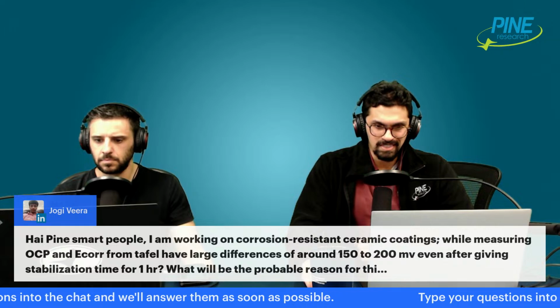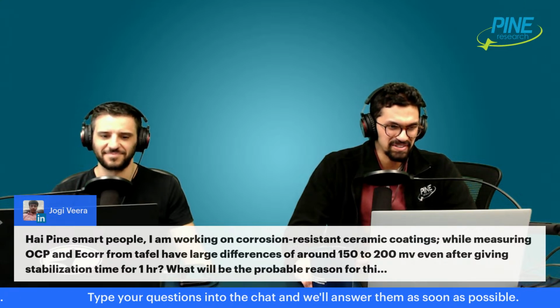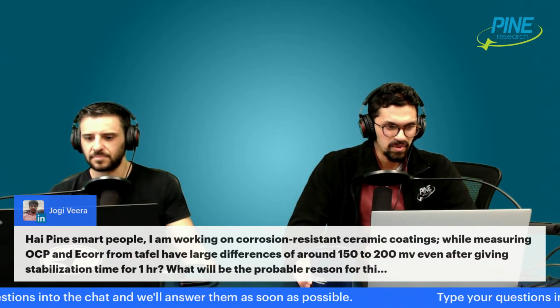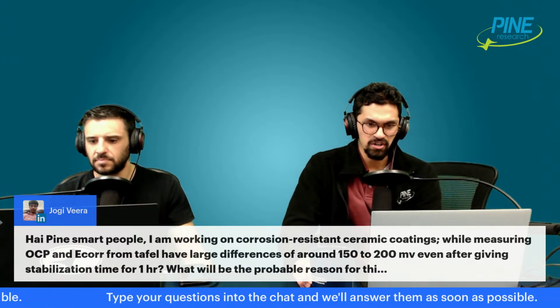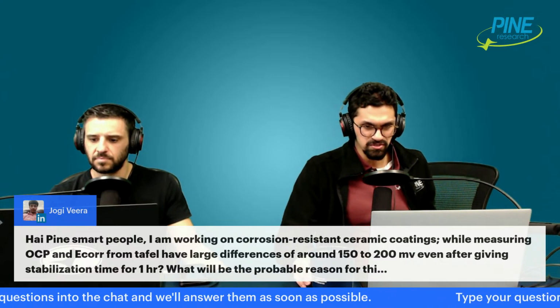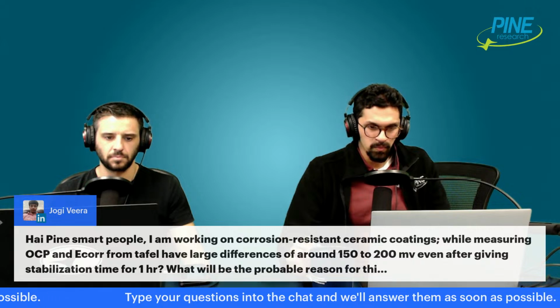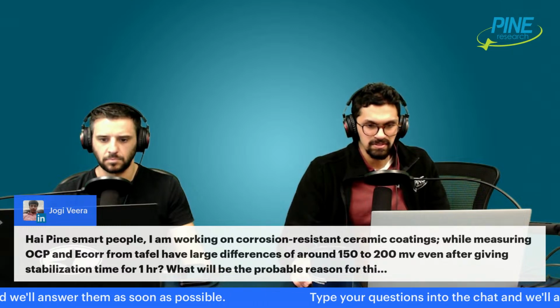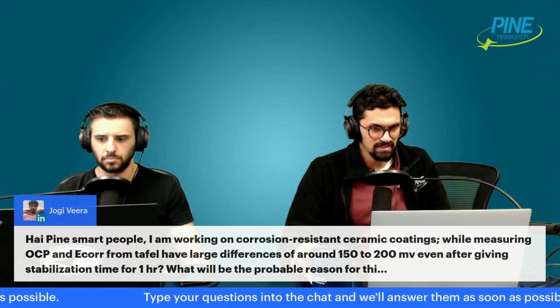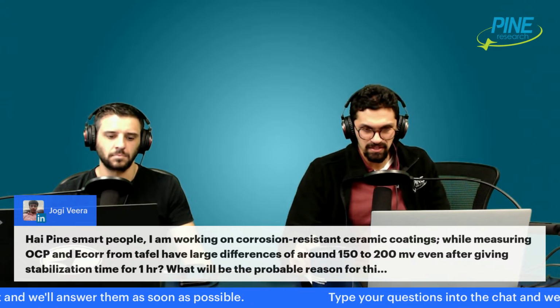Okay. All right. Great. Just moving through. We have a question on LinkedIn from Yogi. He's asking, "Hi, Pine Smart people. I'm working on corrosion-resistant ceramic coatings while measuring open circuit potential, and Ecorr from Tafel have large differences, around 150 to 200 millivolts, even after giving stabilization time of 1 hour. What will be the probable reason for this, or suggest the standard procedure to do the electrochemical measurements?" So why is it the case that the open circuit potential and the Ecorr have very different values?